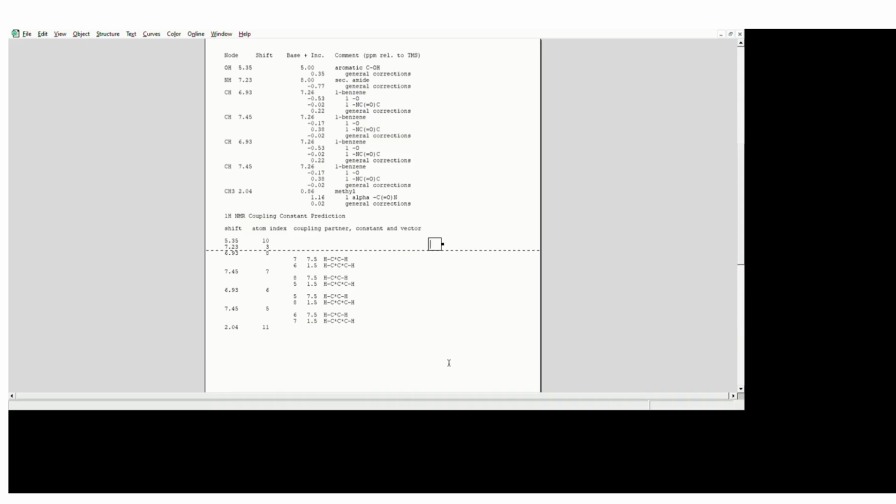Coupling constant, NMR, paracetamol spectra, bonded proton, and how we came to know the two free protons are present in the given compound. That is the D2O exchange. I would like to make a separate video about the D2O exchange.